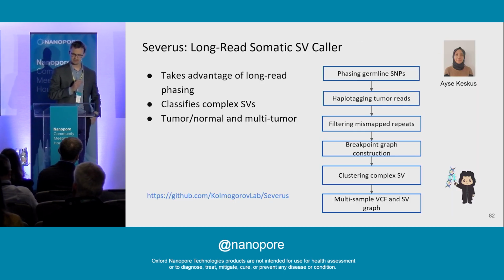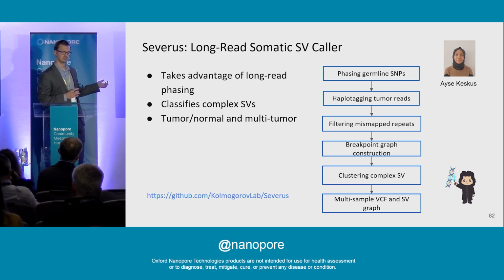So now, how did we call all these somatic variants? Well, we developed a new tool called Severus. The development is led by Aysha, a postdoc in my lab. The tool is now available on GitHub. I welcome you to give it a try.